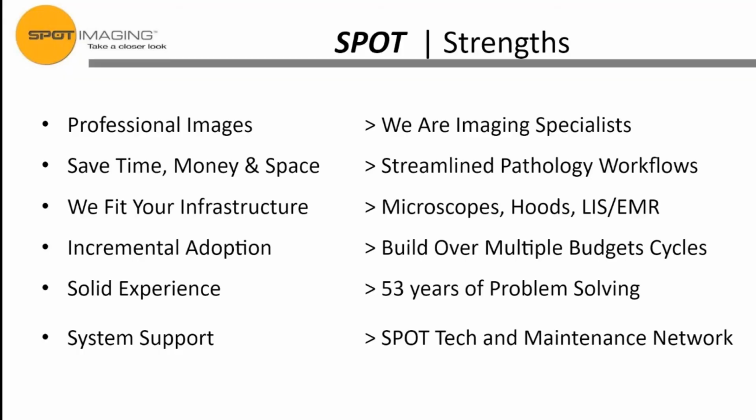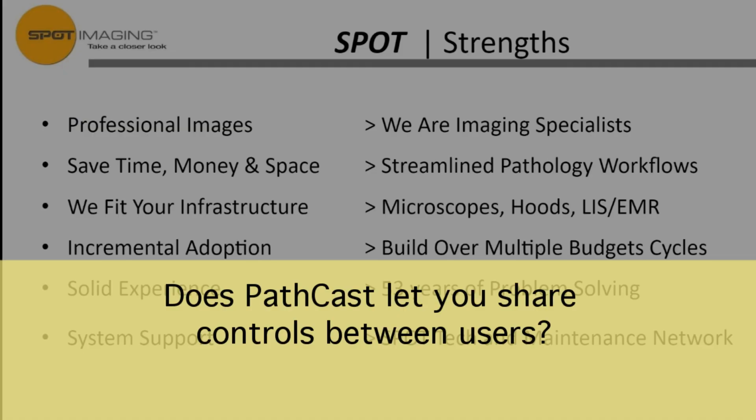From Kathy Popor, does PathCast let you share controls between users? When we say share controls, it allows the remote user to also run both the mouse and any buttons on the mouse as well as the keyboard.